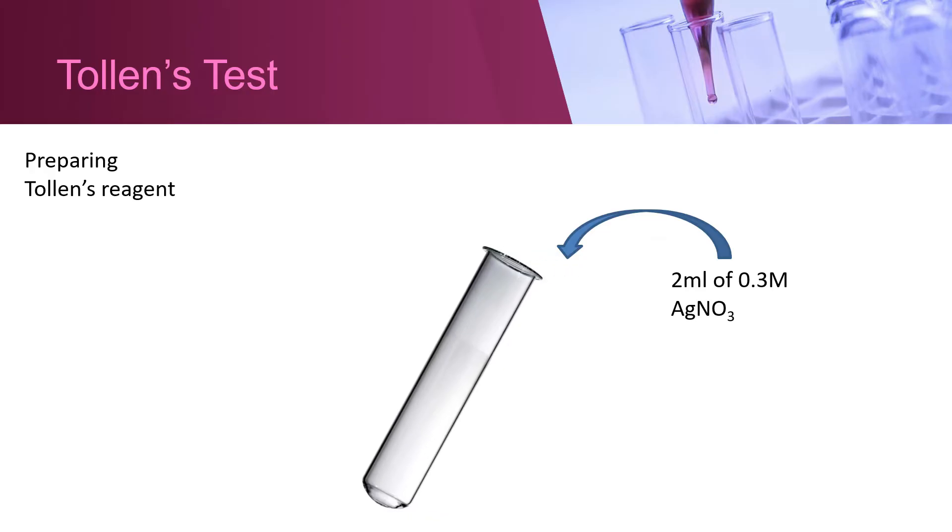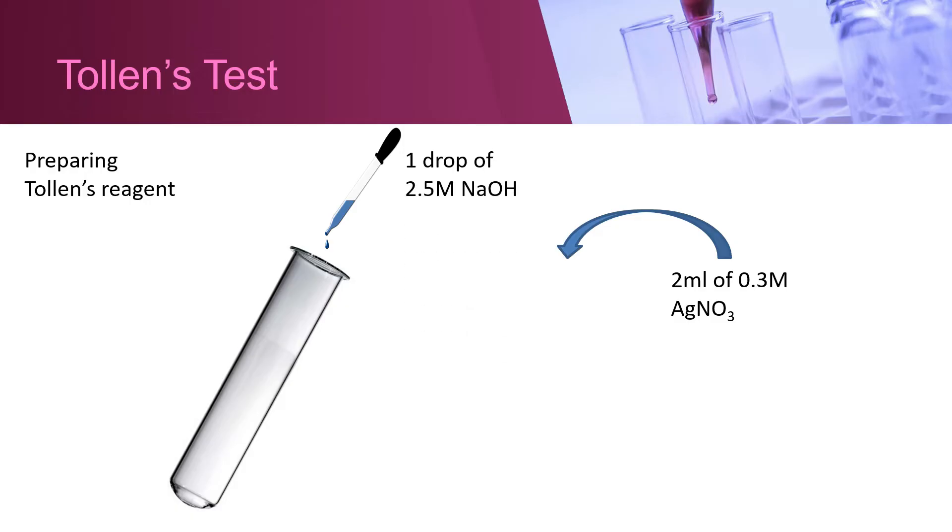Tollen's test - Preparing Tollen's reagent: Add 2 milliliters of 0.3 molar argentum nitrate in a boiling tube. Add 1 drop of 2.5 molar sodium hydroxide.